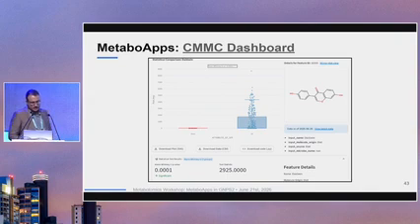So you're going to see a comparison test for the abundance, so the peak area information. You're going to have the details for the microbial information, as I mentioned before. So for example, this one, you're going to have the input name, the molecule origin, the source, and then the microbe name, if it is available.